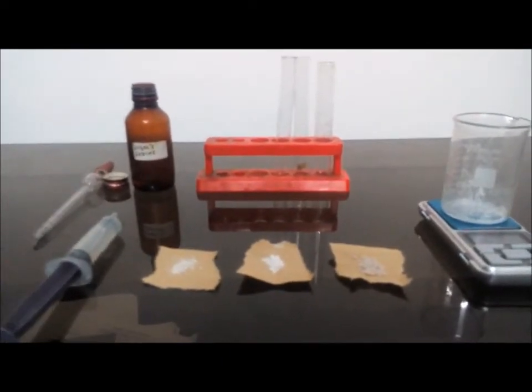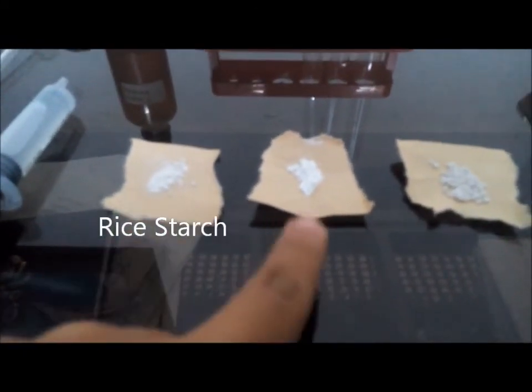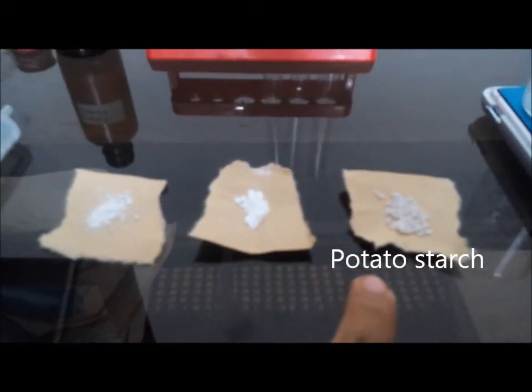Hello, you can see in front of me I have three different substances here. Actually, these are three different types of starch. This one is rice starch, this one is corn starch, and this one is potato starch.